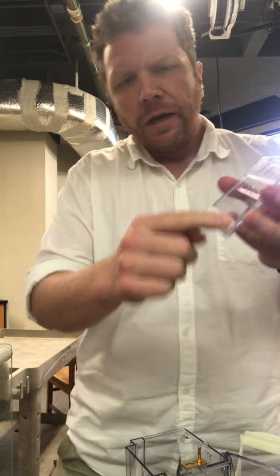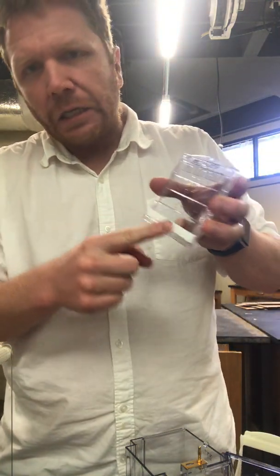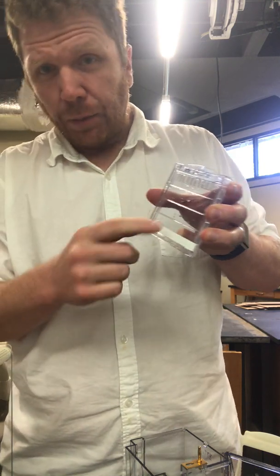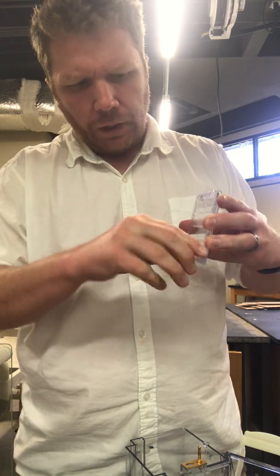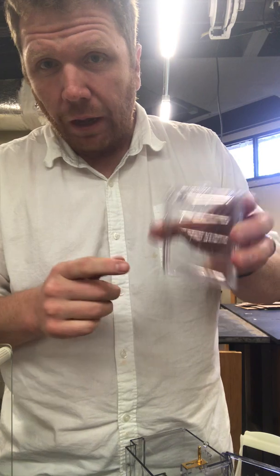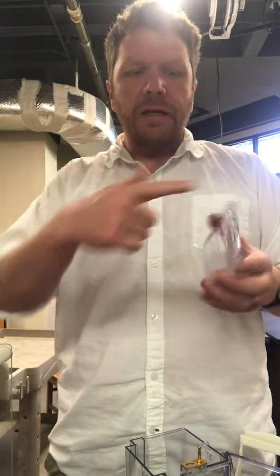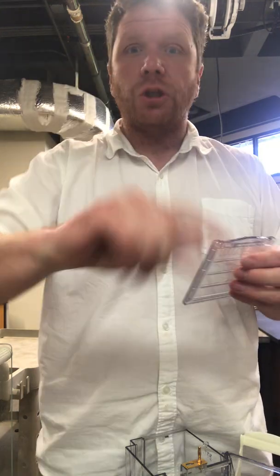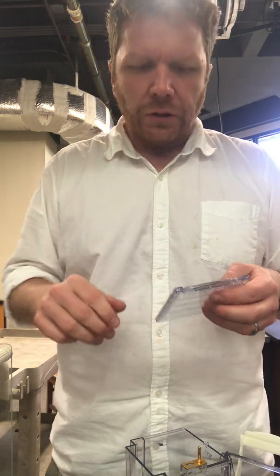There are a couple of things that are very important about a precast gel. One of which is this white strip right here. What that does is seal this opening in this plastic plate, so that this part of the gel can't dry out. You have to take that off when you're running your gel so that the electric current in the solution can actually flow through. If this piece of tape remains, that gel's never gonna run.